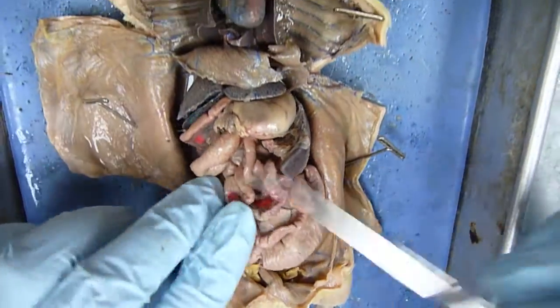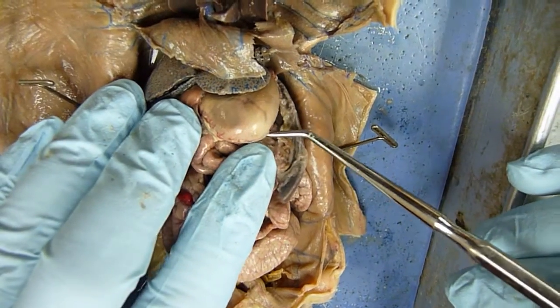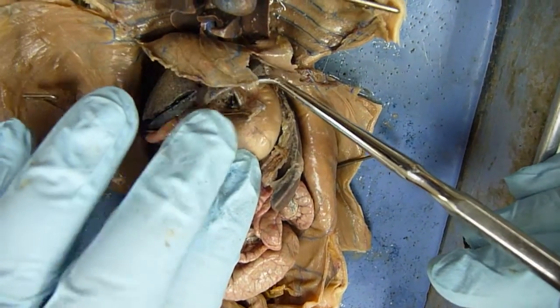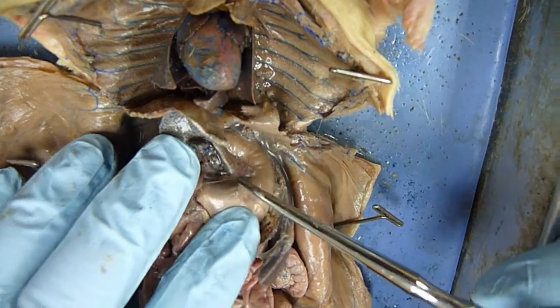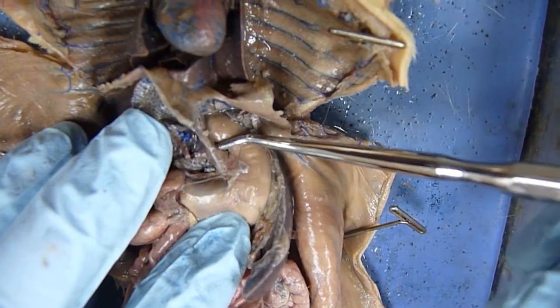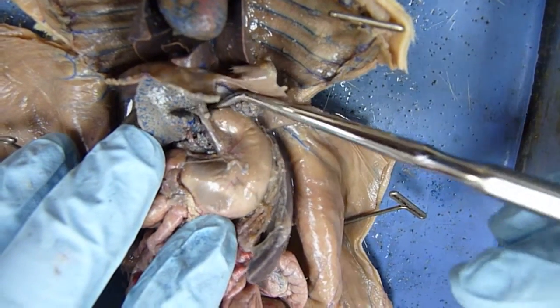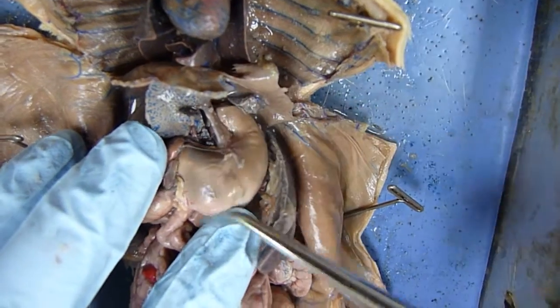Now moving on to the digestive tract. Our first organ that we reach after we swallow food is of course the stomach here. And if we lift up the liver lobe, we can see the esophagus leading into the stomach. Then here's the stomach with many portions to it that you don't have to know.